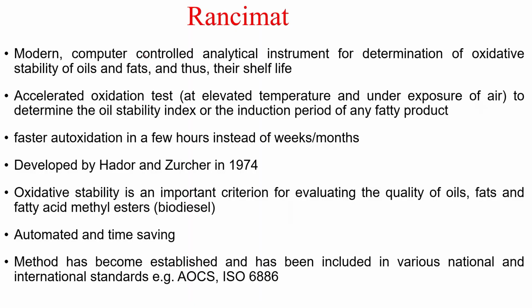Okay, now we will see one by one about the basics of the Rancimat. So the Rancimat consists of a modern computer controlled analytical instrument. It is an instrument for determination of oxidative stability of oils and fats, and thus their shelf life. Ultimately we are predicting the shelf life of any fatty product.